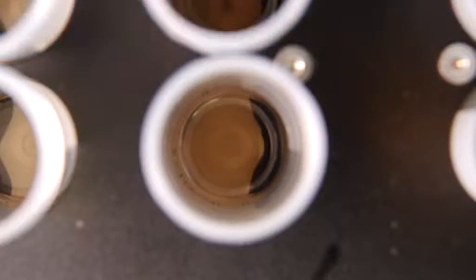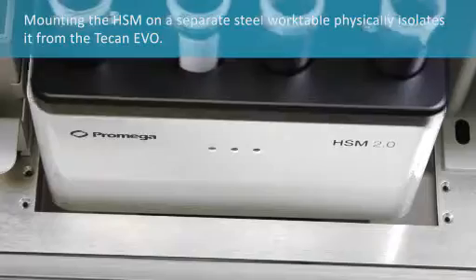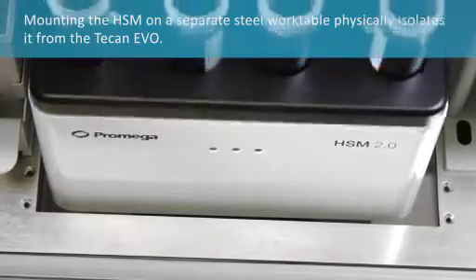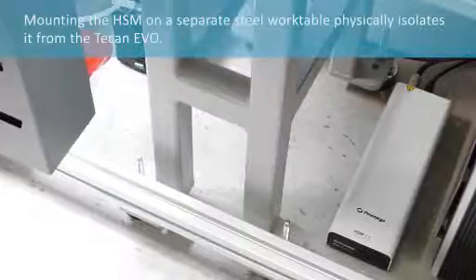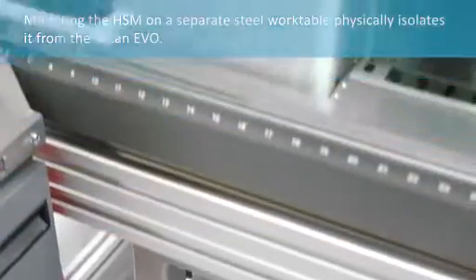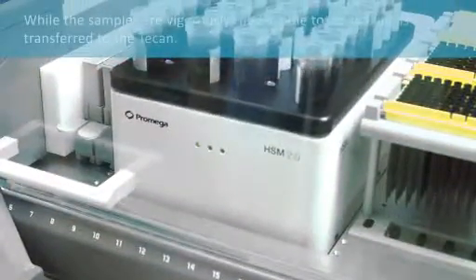Mounting the HSM on a separate steel work table physically isolates it from the Tecan EVO. While the samples are vigorously mixed, little to no shaking is transferred to the Tecan.